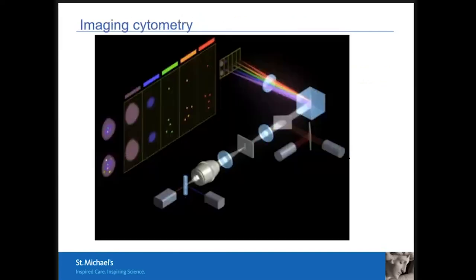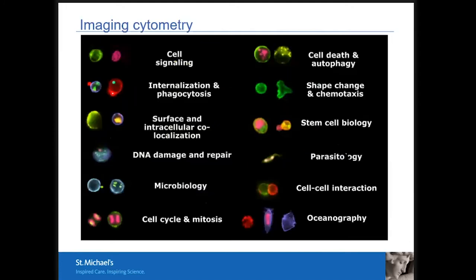assays. In addition, there are imaging flow cytometers. They tend to be a bit more of a niche application, but what they do is they take pictures in all of the different channels of your cells as they go through. So you retain morphological information, even though you still need to dissociate tissue. But it allows you to look at some things like cell interactions, so immunological synapse formation, autophagy, cell cycle, micronuclei, things like that, which would have some degree of relevance to a cancer audience.